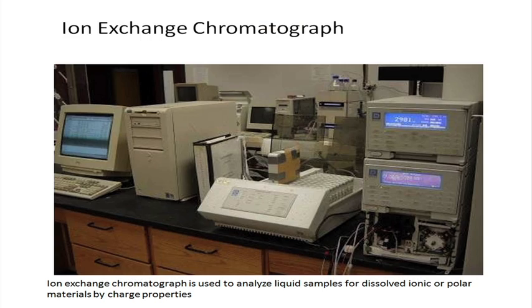With the use of ICP now, in most of the labs ICP is available, or ICP AES, or if any lab has an access to an ICP, people are not using these cation columns much in many of the labs. It's mostly just stuck to the anion column. So that's how it's being used. So that's the ion exchange chromatograph. Next, chromatograph, as I said, it's basically separating different fractions.